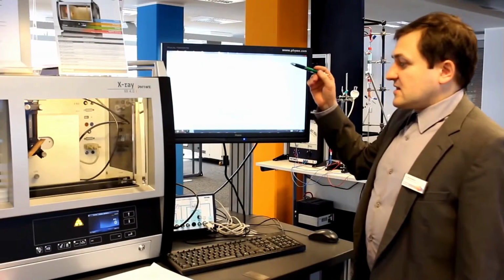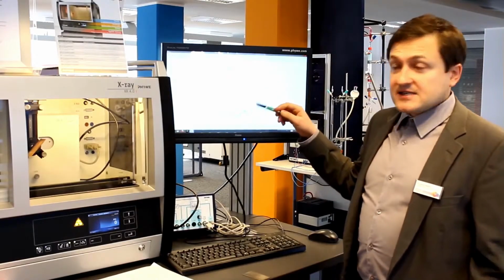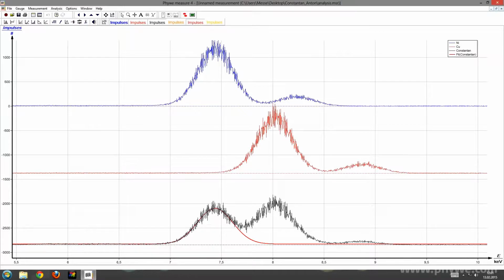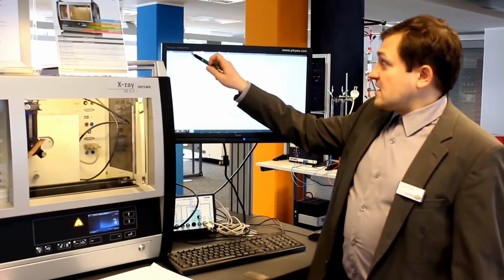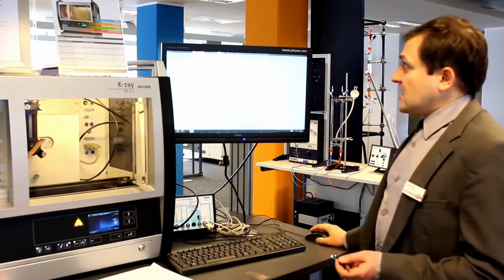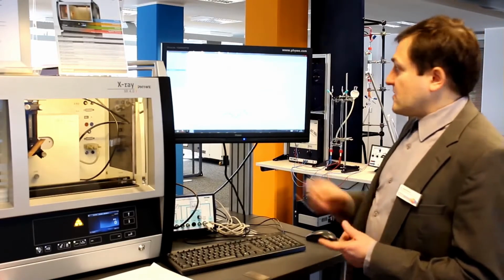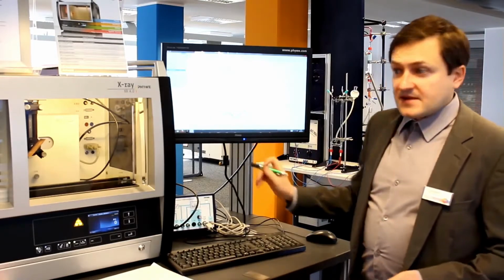To find out how many percent of nickel, for example, constantan has, you have to divide the intensity of the nickel peak inside the constantan spectrum by the nickel peak in pure nickel material. To find out the intensities of peaks better, you can use the function fitting option of our measure software. Here you can fit, for example, a normal distribution as shown with the red line.